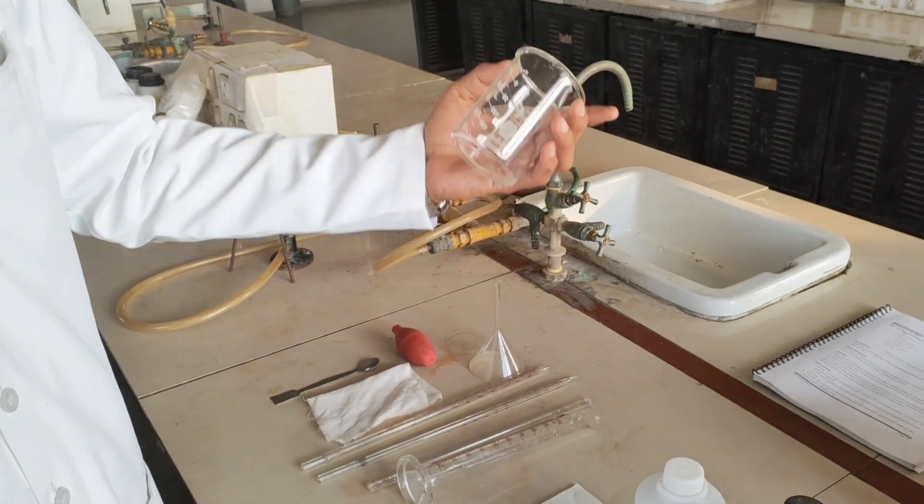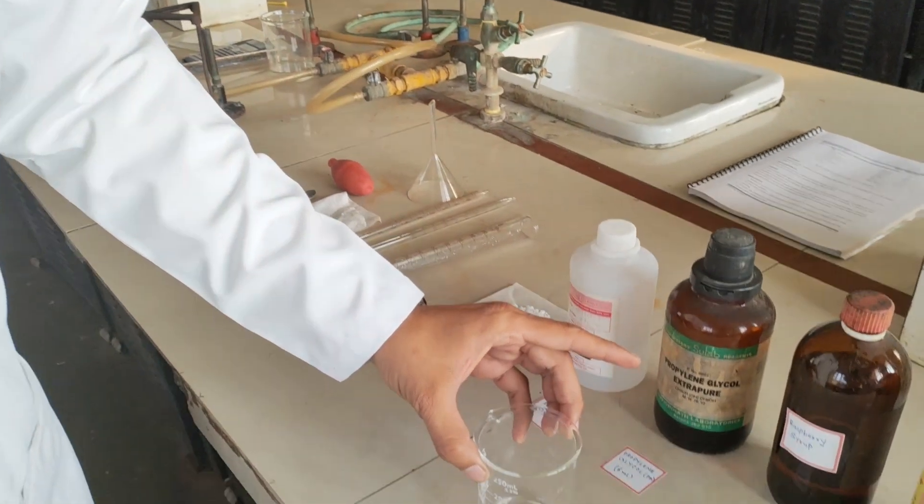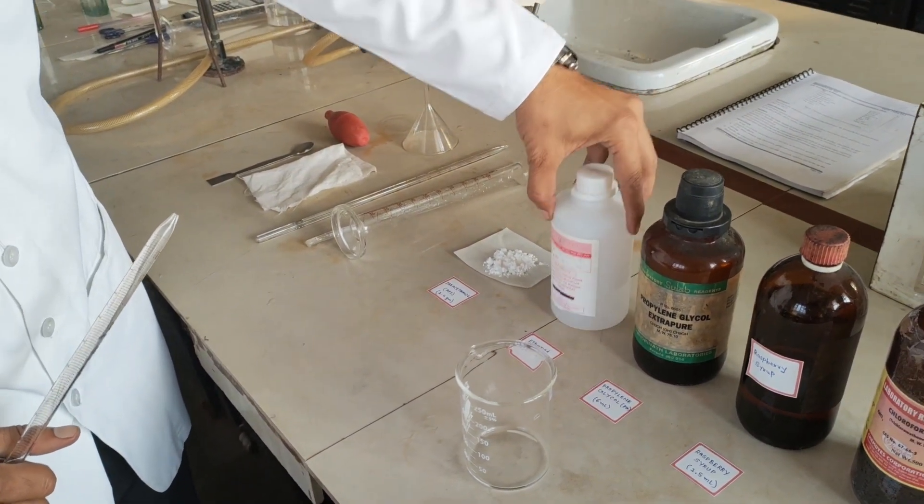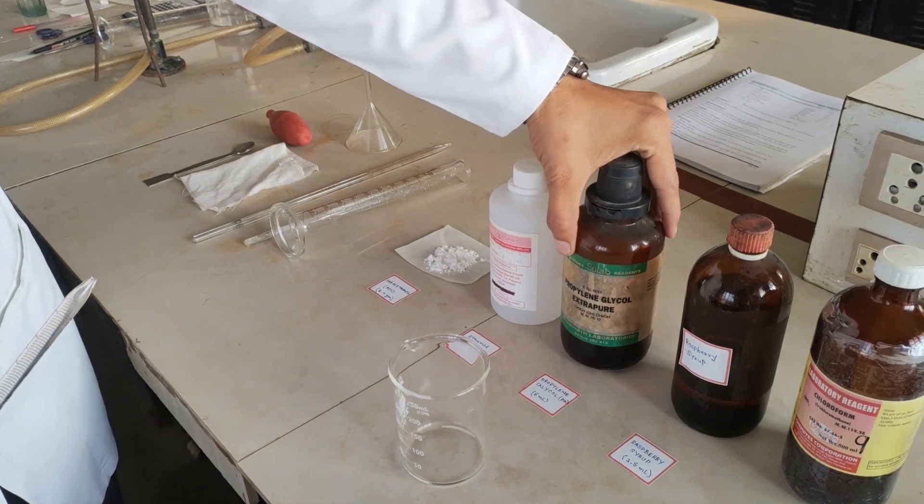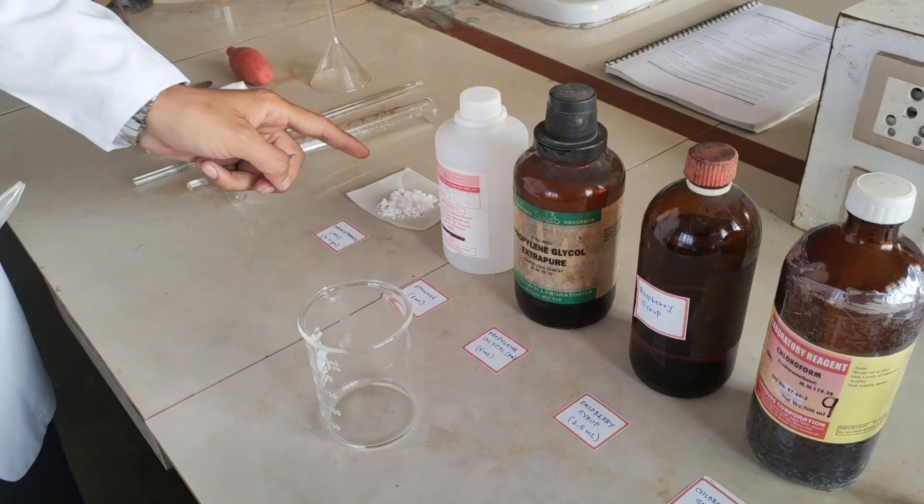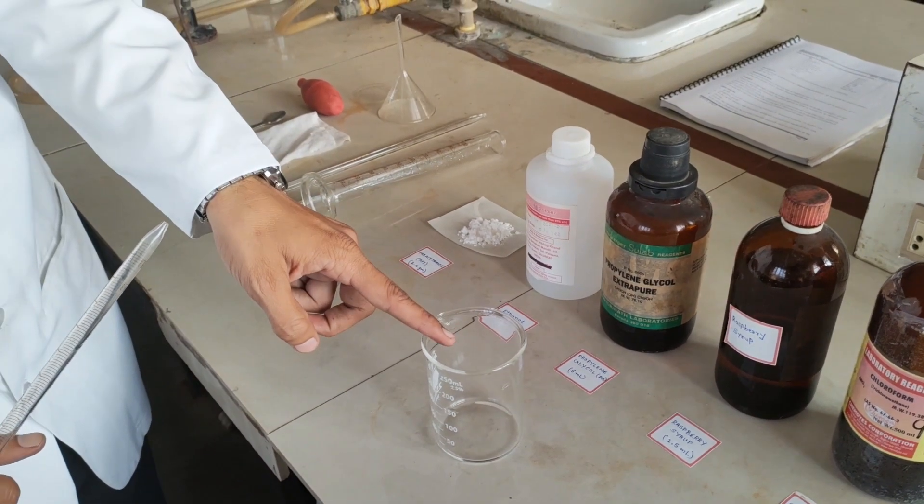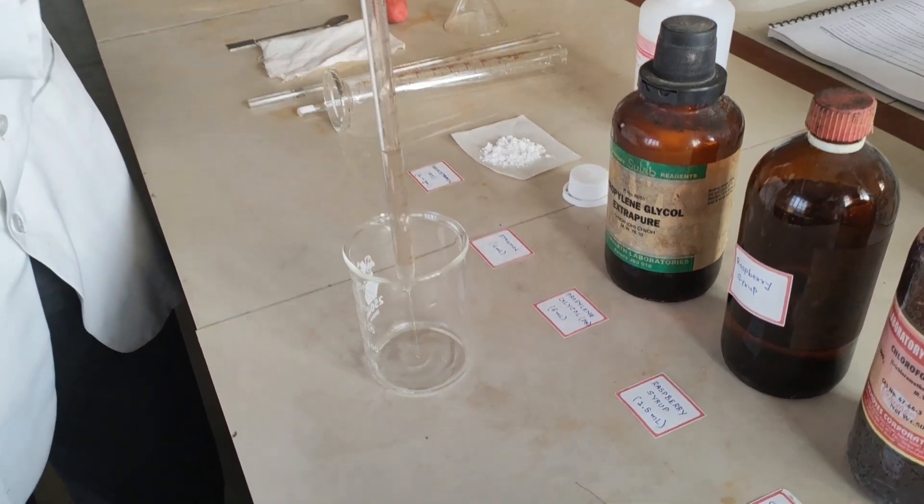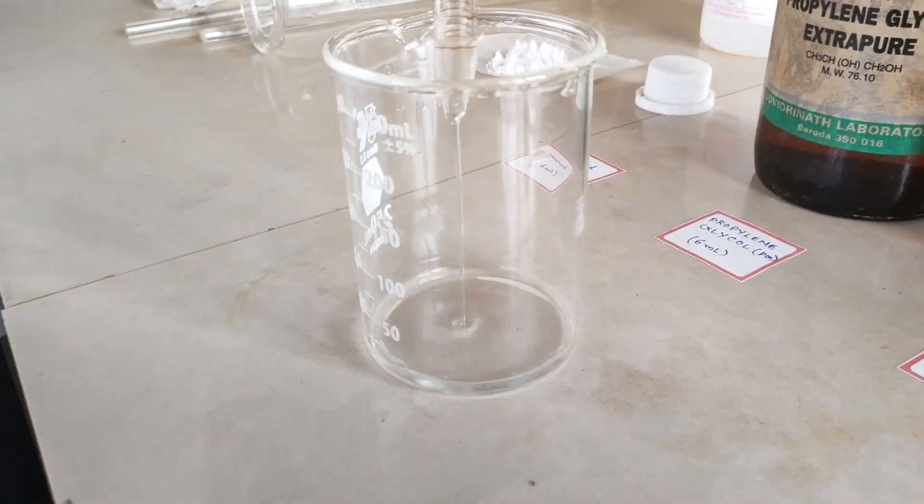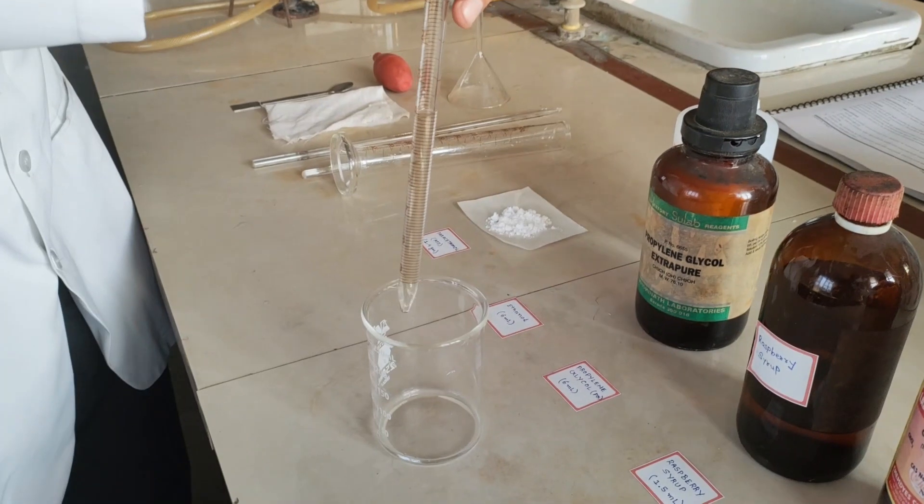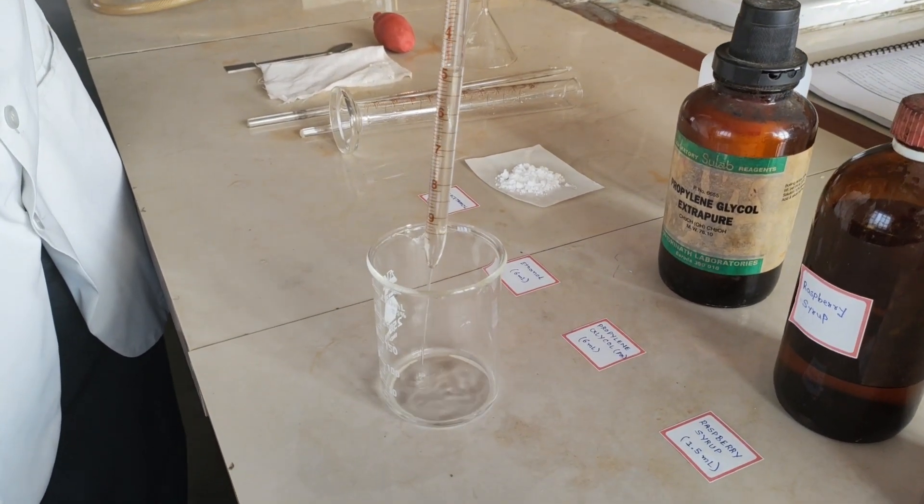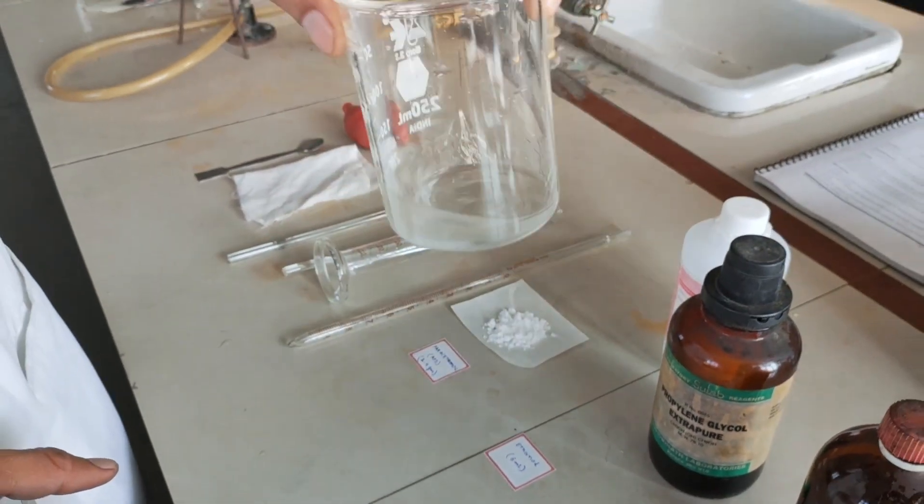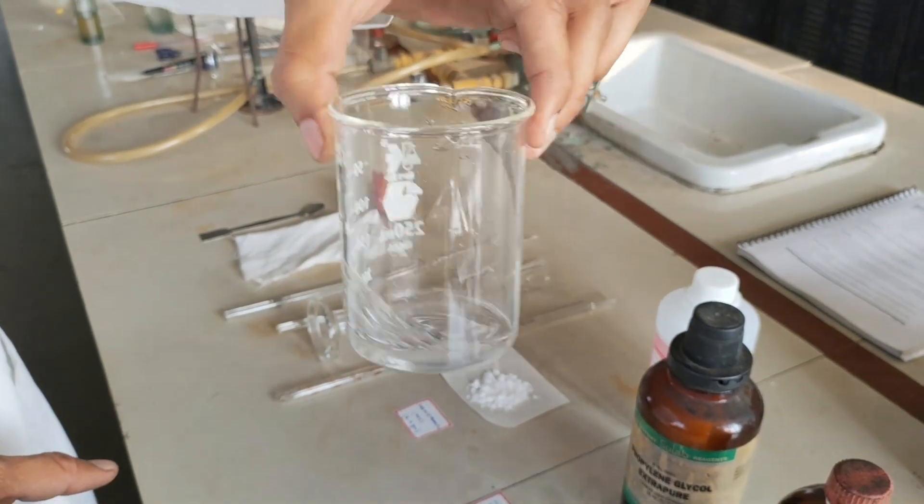Let's start the preparation. Take one beaker. We are going to use ethanol and propylene glycol, both 6ml. Add them and dissolve paracetamol in this mixture. Mix propylene glycol and ethanol together.